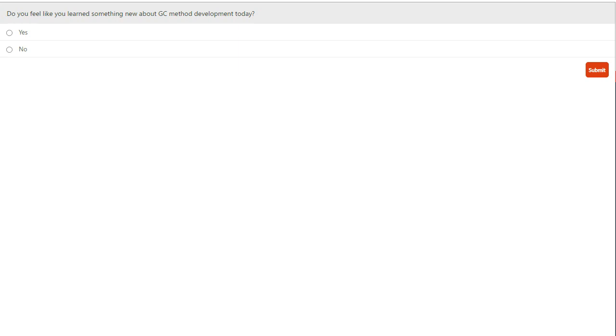For this, I would look initially at retention time, and that should be associated, if we're looking at a non-polar column, with the boiling point. But we can also look at compounds that have a very similar structure, and that would be the route forward. Ideally a stable isotope label, but failing that, something that has a similar retention time, because that would then undergo similar physical processes within the column. Any differences that you might see because of eluting at different retention times would be eradicated. So that would be my suggestion for that one. But good question, thank you.